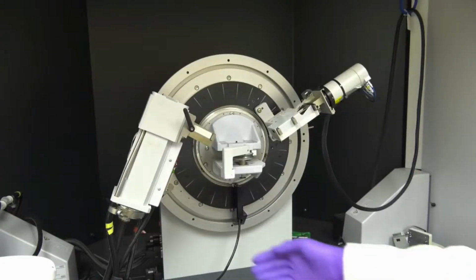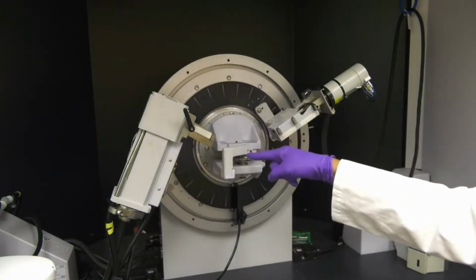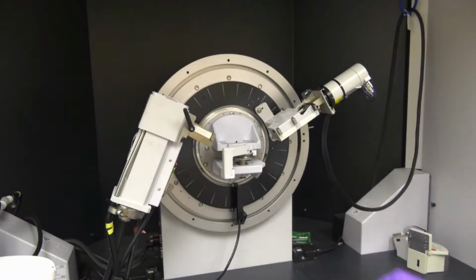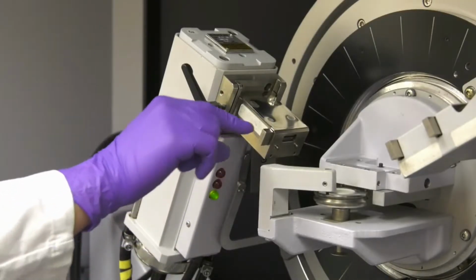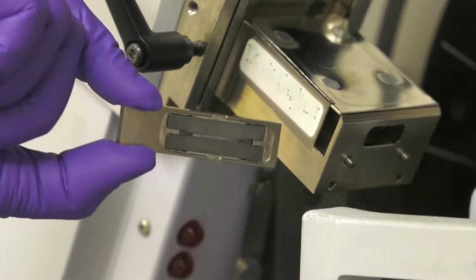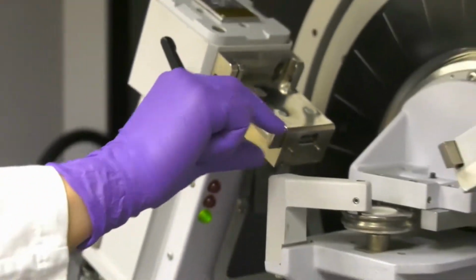X-rays are generated by accelerating electrons into a copper target. X-rays are directed towards the sample where they diffract. Angles of constructive interference will diffract X-rays into the one-dimensional detector, which transduces the X-ray intensity. The X-ray beam leaving the X-ray generator is confined by the divergent slit. The length of the sample that is illuminated by X-rays depends on the diffraction angle and divergent slit size.